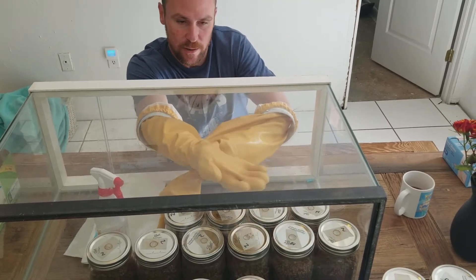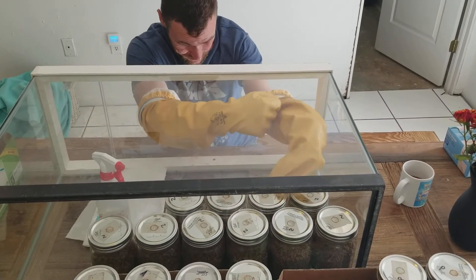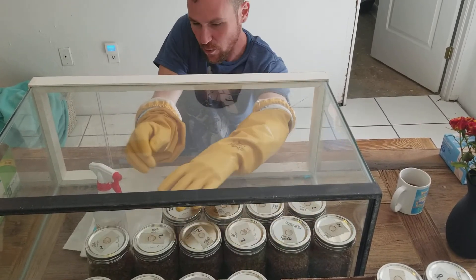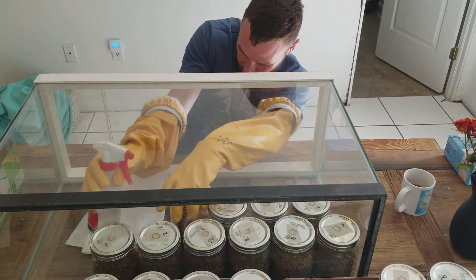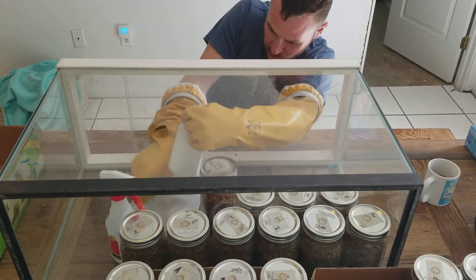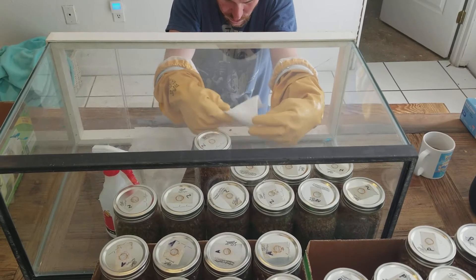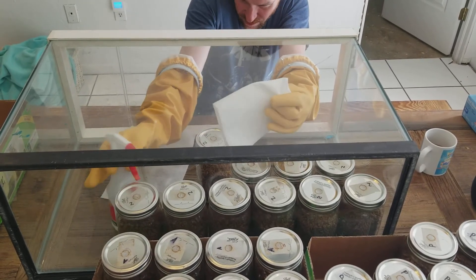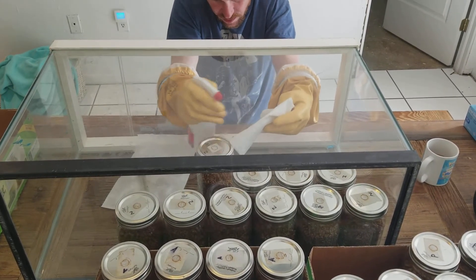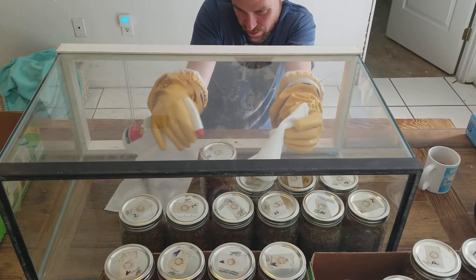I'm going to go ahead and start by getting my hands in the gloves here. In the glove box — the still air box — it keeps the air still in here and limits your exposure to air movement, and to spores and other germs or bacteria. Since we sprayed all the bottles off and they've been sitting in this kind of dense, alcohol-filled air for a while, it's pretty sterile in here.